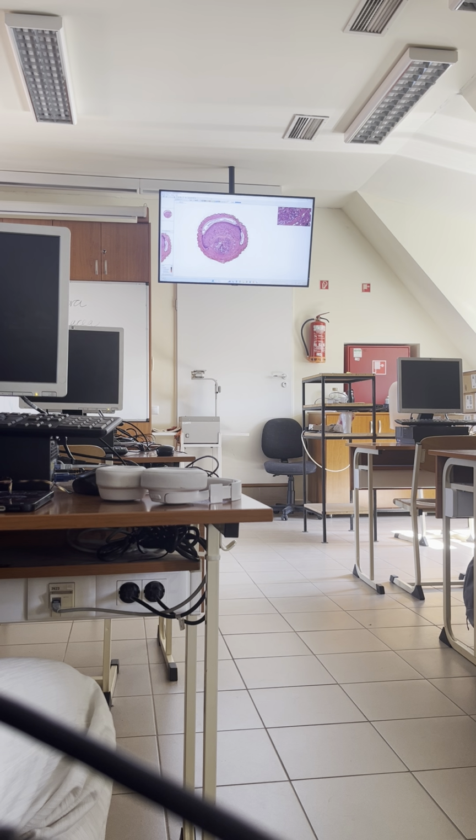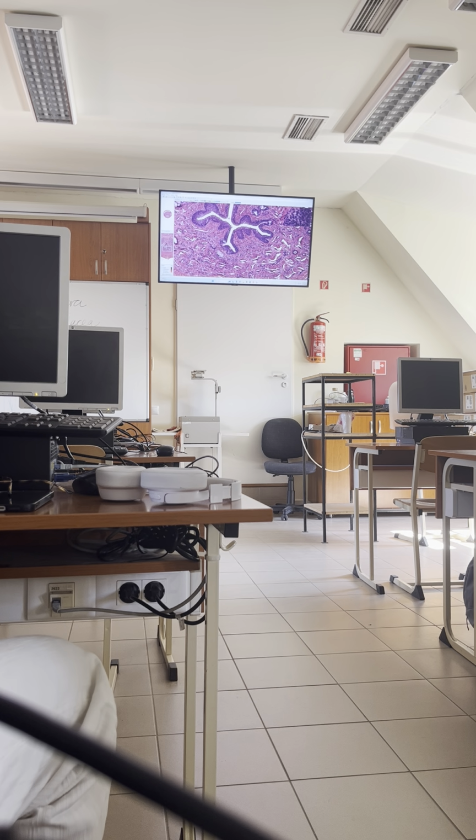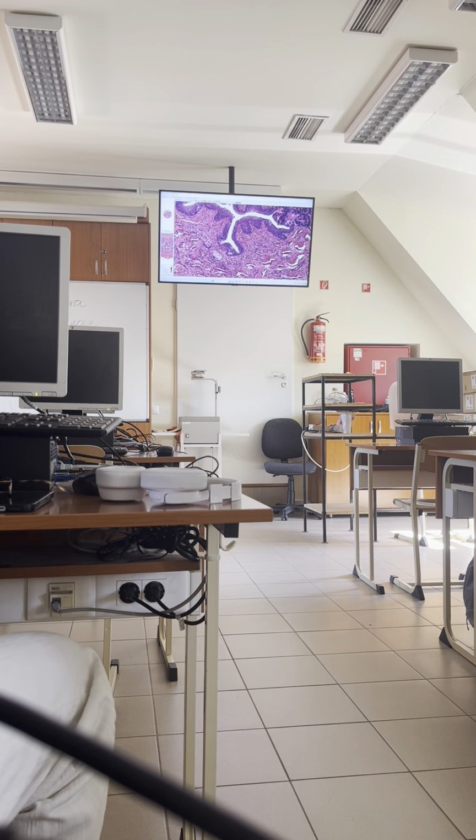So this is a fetal penis in cross-section. Here is the urethra with the corpus spongiosum and with the two corpora cavernosa. Here you can also see the tunica albuginea and the septum penis, male urethra, and in addition to these endoepithelial glands, like here, this paler territory, or like that, here, endoepithelial glands.